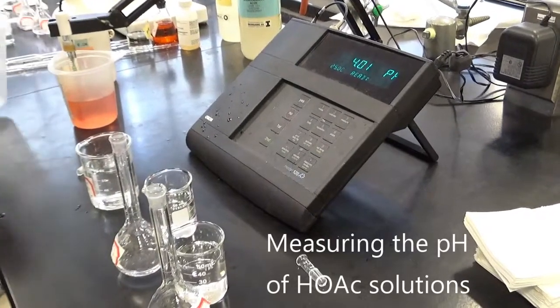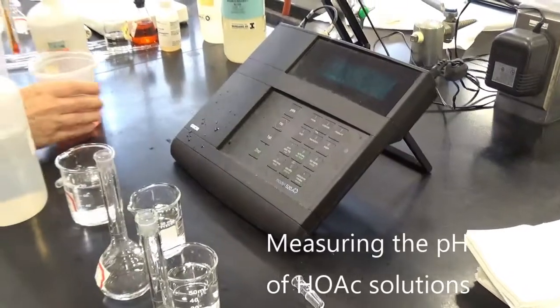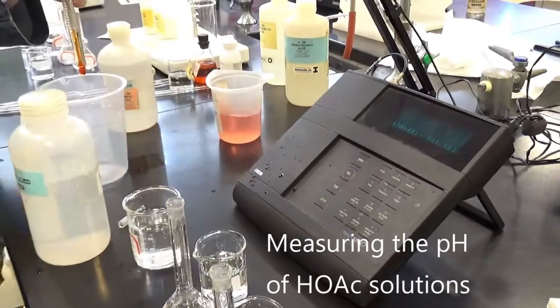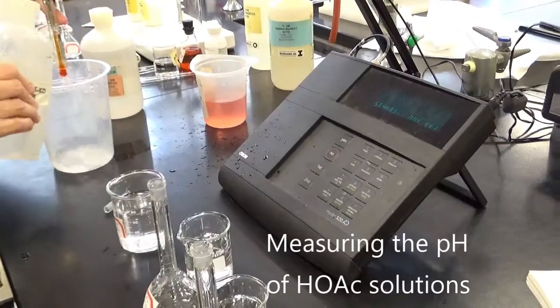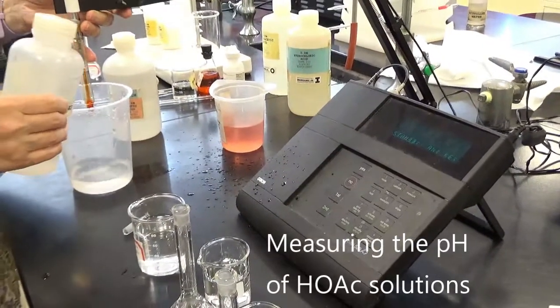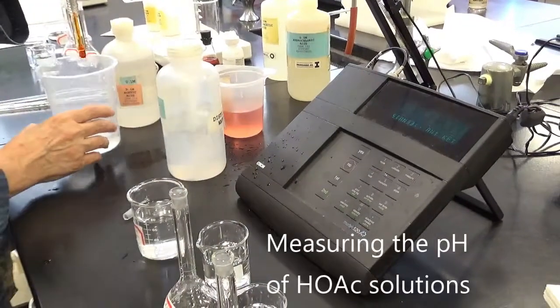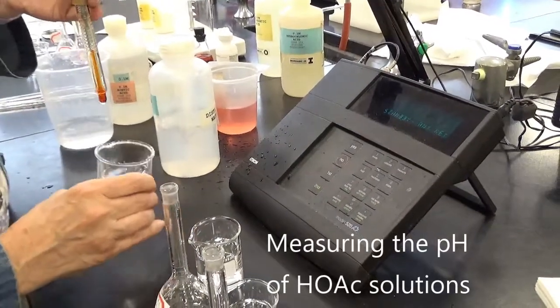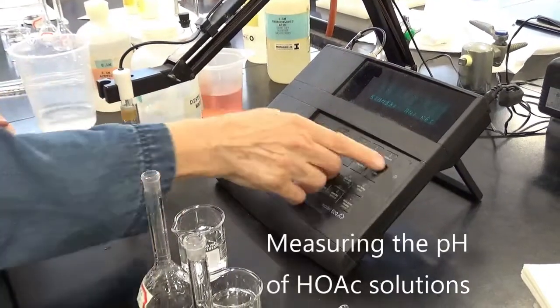And again, I'm going to have to rinse this pH electrode with plenty of water. Don't be stingy with the water when you do this in real life at some point, which I hope you get the opportunity to do. Now we'll put it in the 0.10 molar acetic acid.